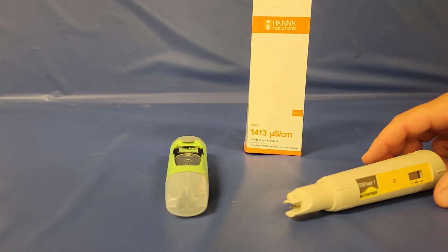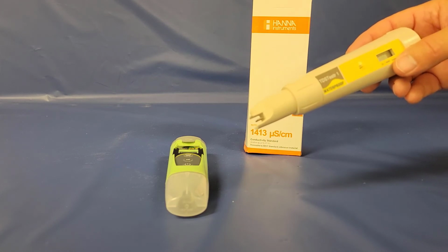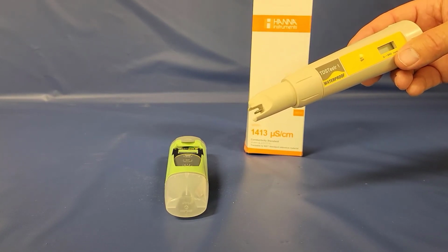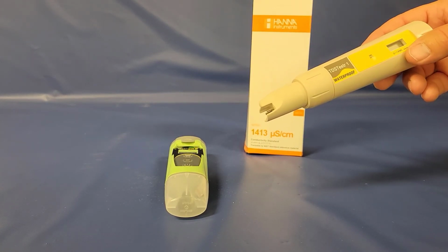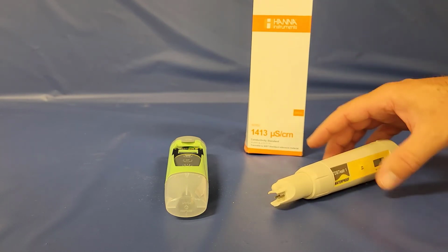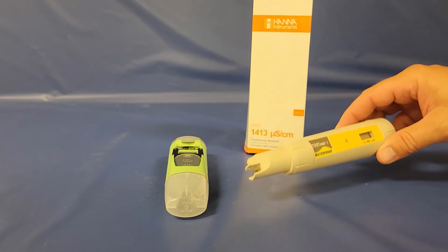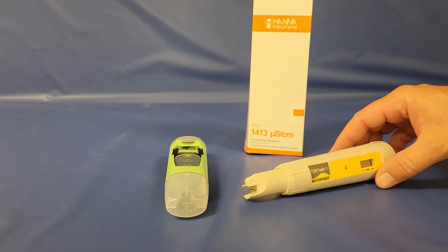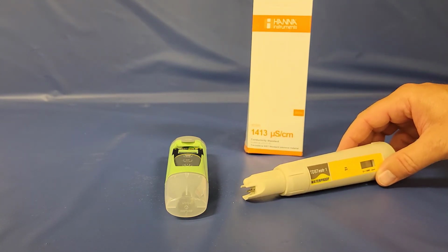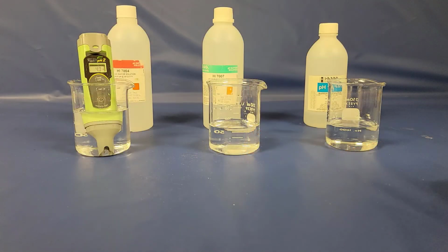So just to also let you know, there are other types of testers on the market. This particular unit is a TDS tester, so it will test for total dissolved solids in the water. And there are calibration solutions for those. You can see in this particular case, there's a solution or the concentration that it should be measuring. So the calibration procedure is very similar for these different types of units. I just showed you what it was for the pH meter, but you can also do the same thing for other meters.